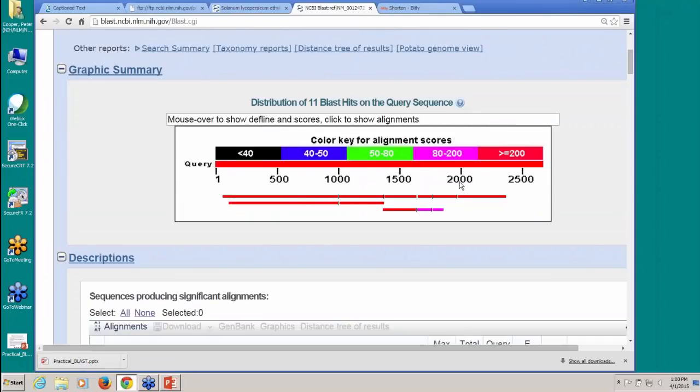So I have three sort of distinct kind of hits. Theirs are aligned onto my messenger RNA. This little black line here lets you know that these hits are separated on the genomic sequence by some distance. And so basically what I've done is I've highlighted the exons of a gene.